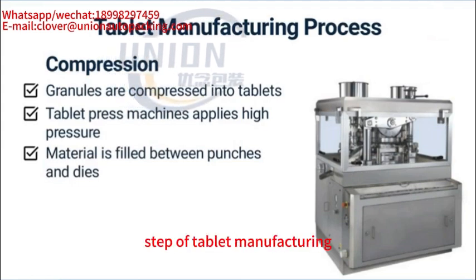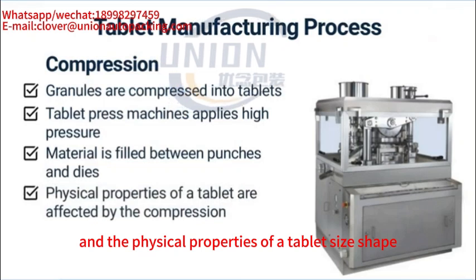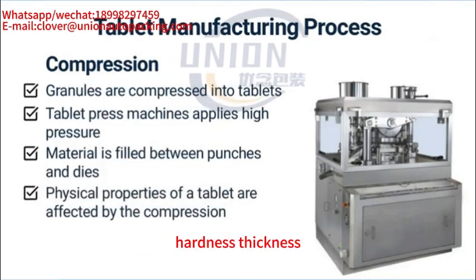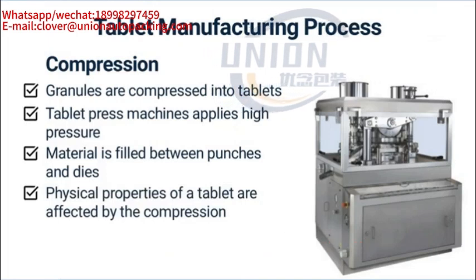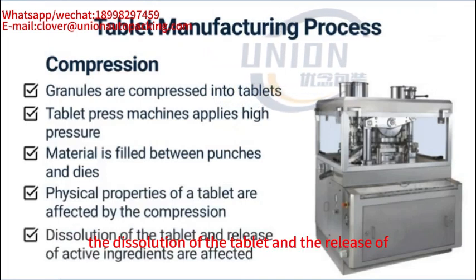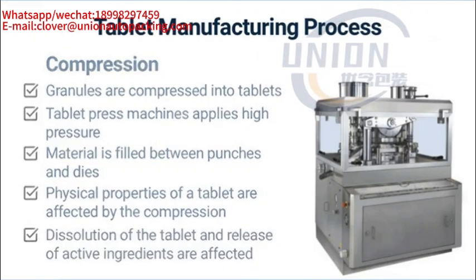Compression is an important step of tablet manufacturing, and the physical properties of a tablet, which are size, shape, hardness, thickness, and friability, are affected by the compression. The dissolution of the tablet and the release of active ingredients are also affected by the compression of the tablet.